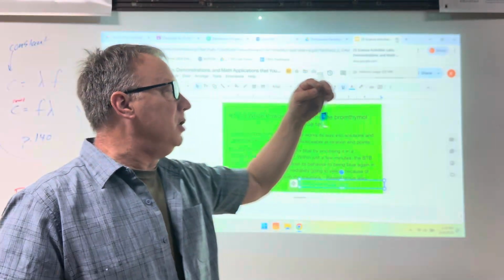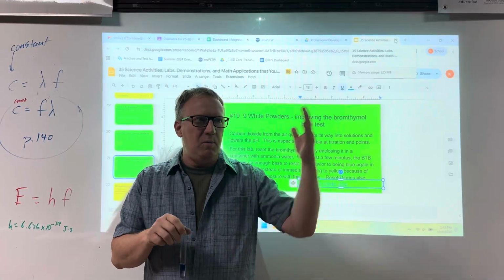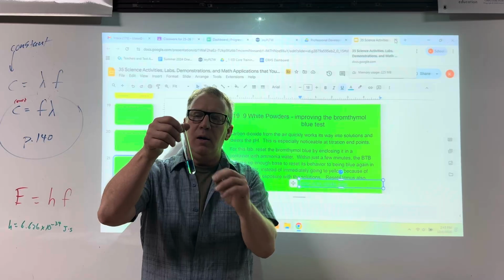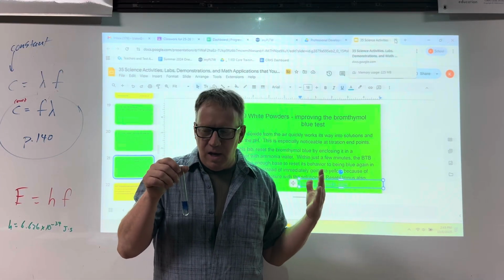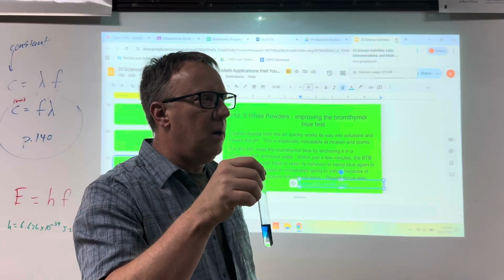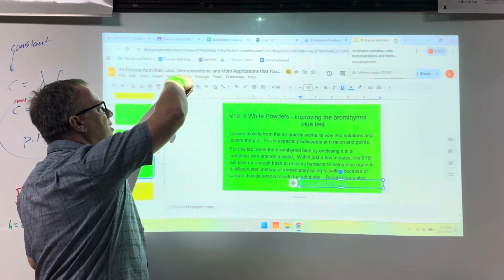But I was putting the bromethymol blue in with the solutions, and the bromethymol blue was a couple years old, had been opened a whole bunch of times to get carbon dioxide in there, and it would go in the water, and I'd get yellow on every result. It's like, well, I gotta find a way to get that back to blue, so it's only turning yellow when I put it with boric acid and everything else. So it stays blue this way.